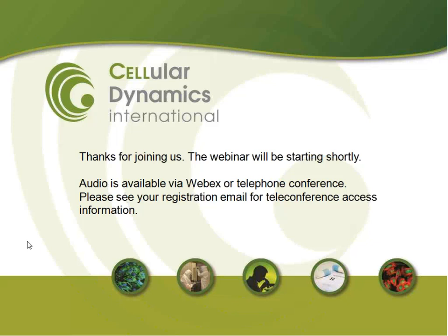And today we'll be talking about the iCell Cardiomyocytes and go into some of their general characterization, and then into some of the utility and different ways that they've been used out in the field.